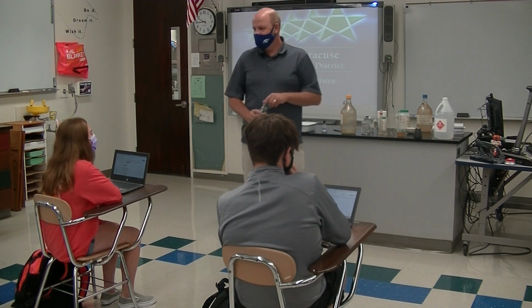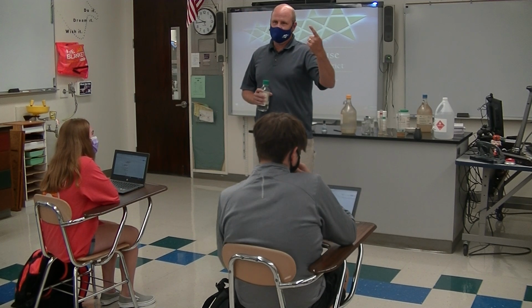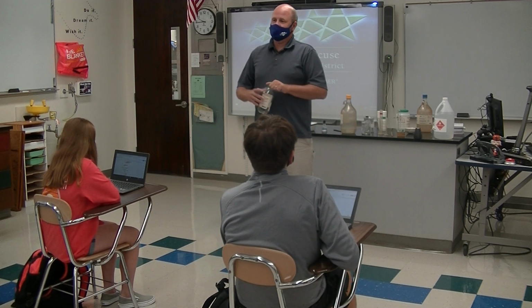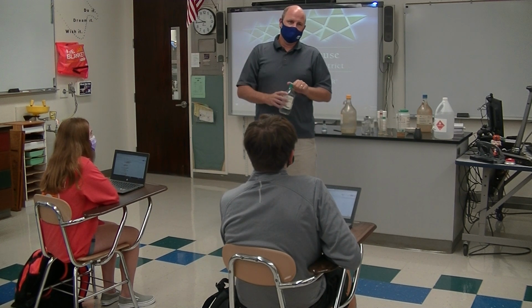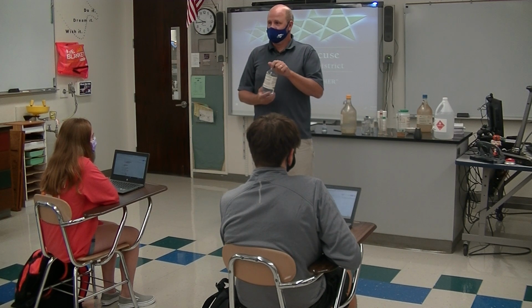No one? You don't know what it is? Smelling salts. Have you ever smelled smelling salts? It's ammonia. Some people say it smells like stinky feet, some people say it smells like a cat litter box, because that's ammonia. This is really strong ammonia.